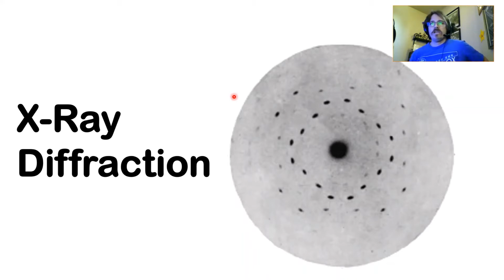But the early days of diffraction, namely Laue diffraction by a scientist with the last name of Laue, and we'll talk about this person later, generated diffraction patterns that look very much like what you see on TEMs. So X-ray diffractometry looks a lot like electron diffraction if you look at it from a pattern point of view.